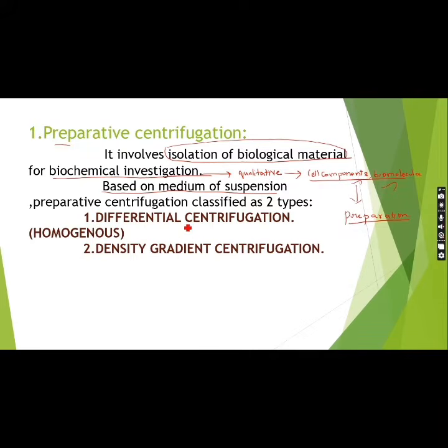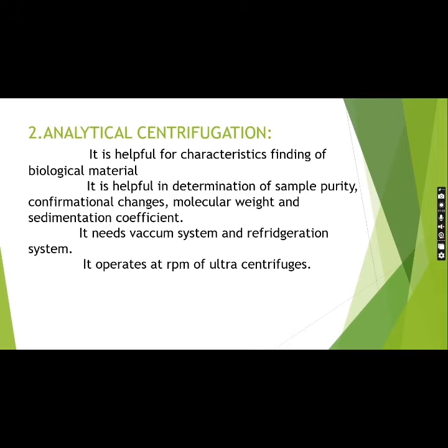So, differential centrifugation, which we can also call homogeneous centrifugation, because there is going to be a single gradient used. But in the case of density gradient centrifugation, different types of gradient can be used.